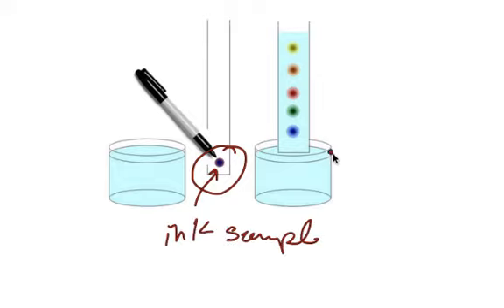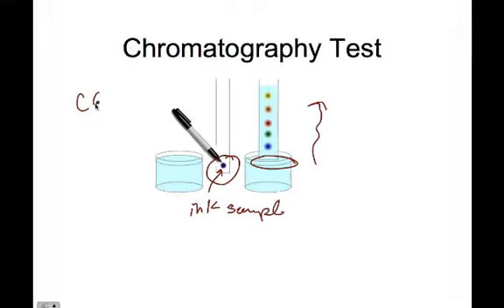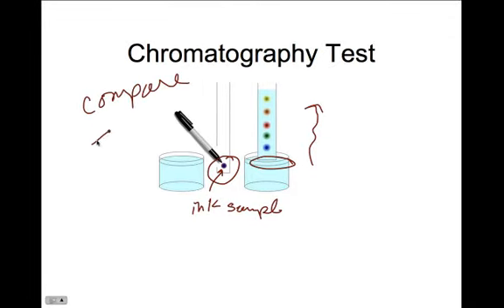And then you're going to let it just barely touch, and by this process called capillary action, these pens are going to give a trademark color. Some are going to perhaps spread in all these different colors. Some are going to give funky little designs. But the thing is, you're going to compare again with, yes, compare with what? Our mystery note that was found at the crime scene.